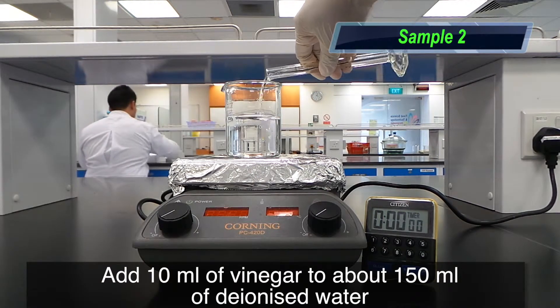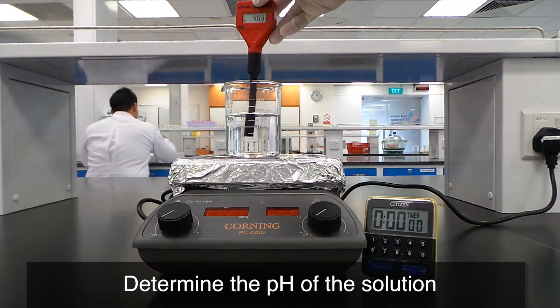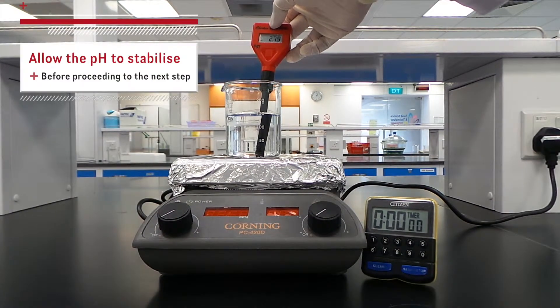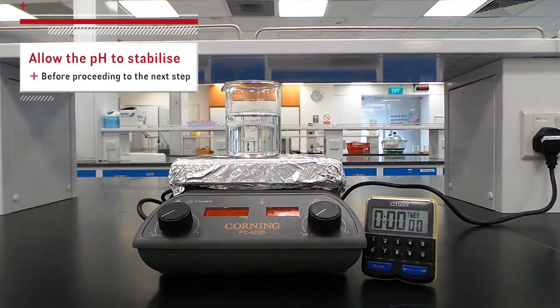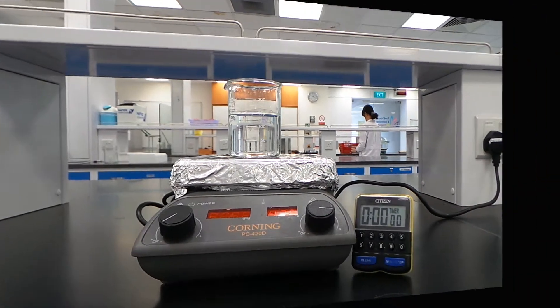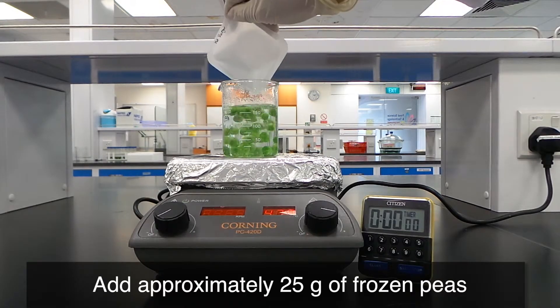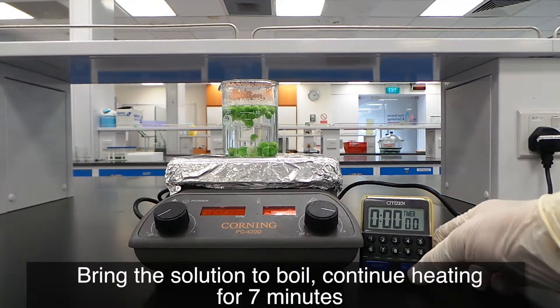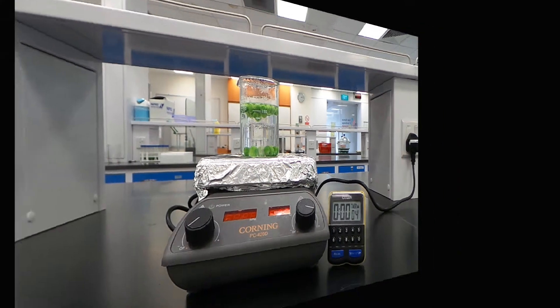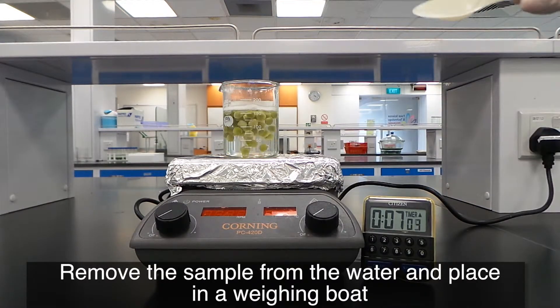Add 10 ml of vinegar to about 150 ml of de-ionized water. Determine the pH of the solution and allow the pH to stabilize before proceeding to the next step. Heat the solution to boiling. Add approximately 25g of frozen peas, bring to a boil, and continue heating for 7 minutes. Remove the sample and place in a weighing boat.